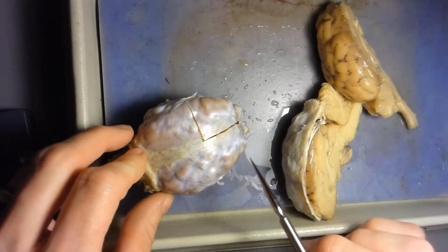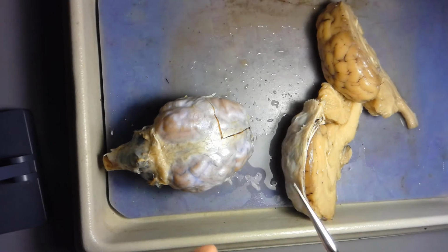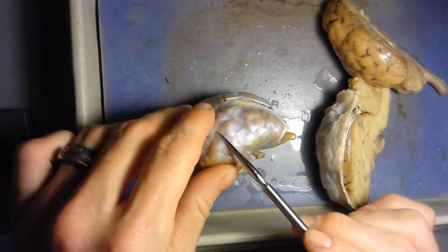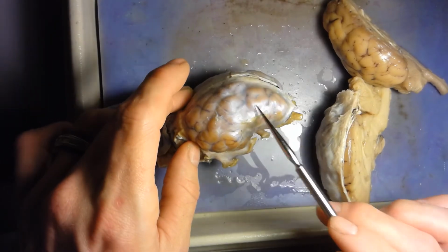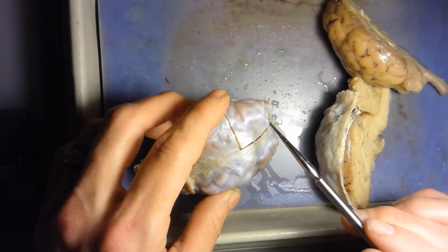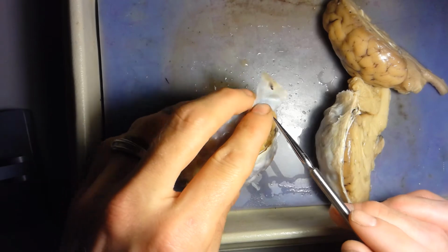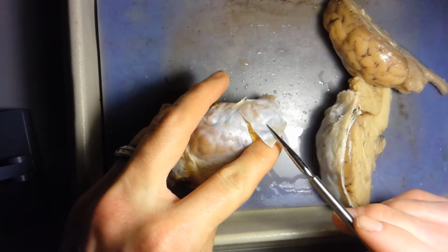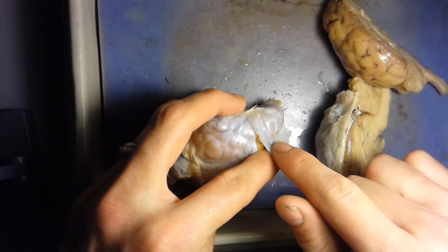Alright, so the meninges. We have not covered the meninges yet because they were not seen on a model, but now you can see them. You see this really tough tissue that's surrounding this brain here. That's the meninges right here. Now there's 3 of them. So I made a little cut right here so we can pull the meninges apart here. Now the outer meninge is called dura mater. So this is dura. Dura mater is on the outside.